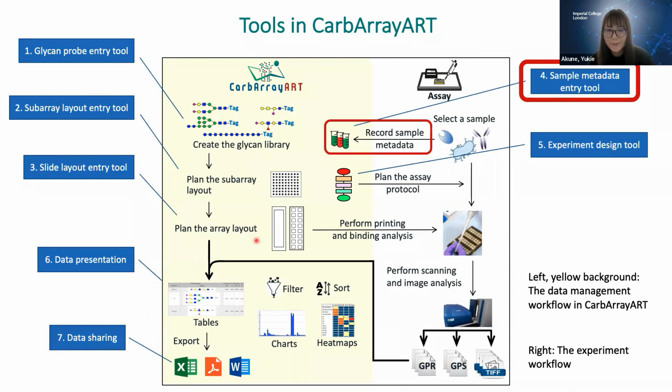Then I'd like to move to the sample metadata. This is more like a lab note. You can record the sample information, sample metadata, in CarbArrayART, just for your lab record, but also you can use it for data presentation or data reporting.